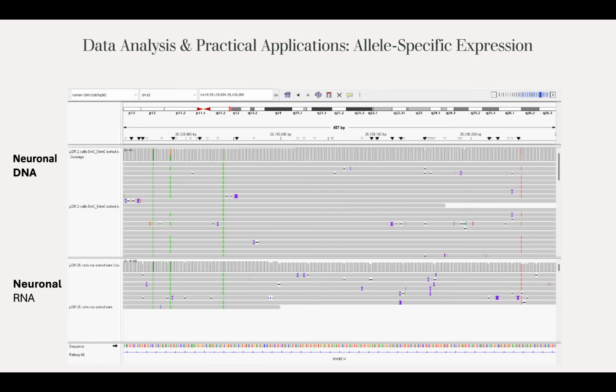Somebody with Angelman syndrome has neurons that have completely terminated expression of UBE3A. So for our system, we were curious to see if we could produce iPSC-derived neurons that recapitulate this imprinting pattern, this monoallelic expression of UBE3A. So this is the UBE3A locus ported into IGV.